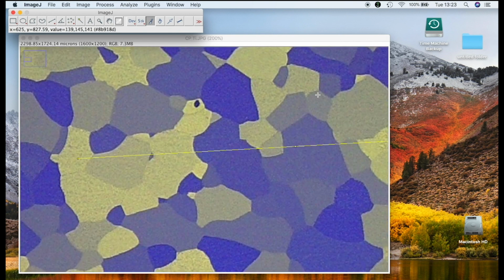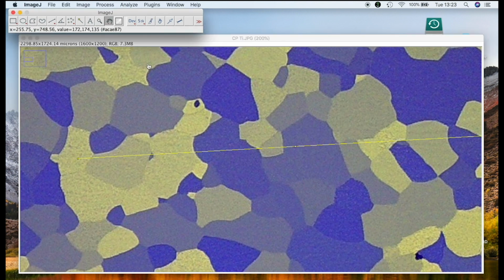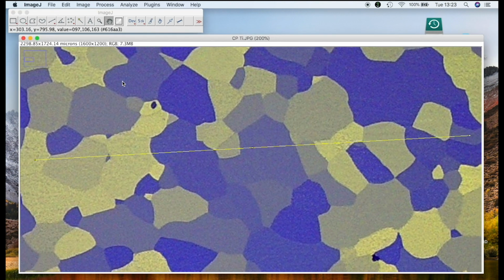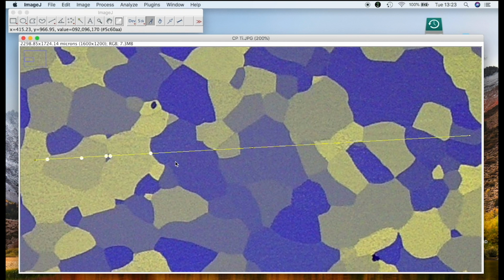I need to go in a little bit further actually to get more resolution. So let me expand this out a bit more and use this hand tool to move across. Right, I think that's probably the best I'm going to manage at the moment. Right, so there's one boundary there. There's an obscure one there. There's probably two there, a very small grain. That might throw the measurement, but I think there's another. That's very difficult to see. You can start seeing the limitations of this.